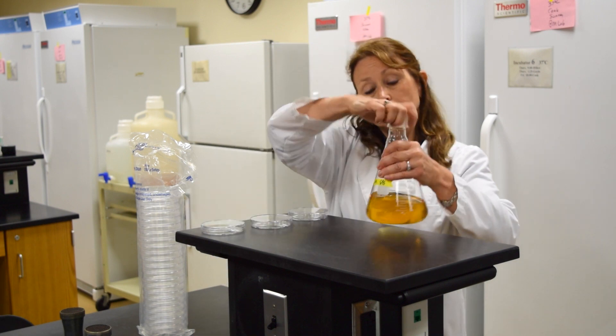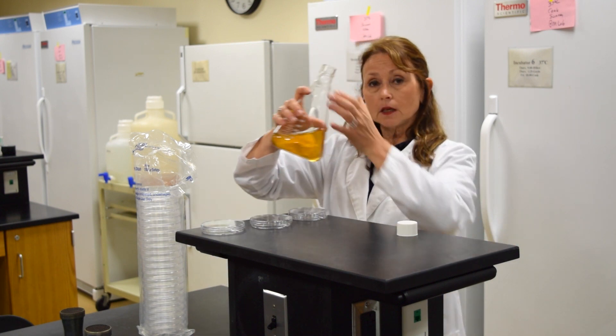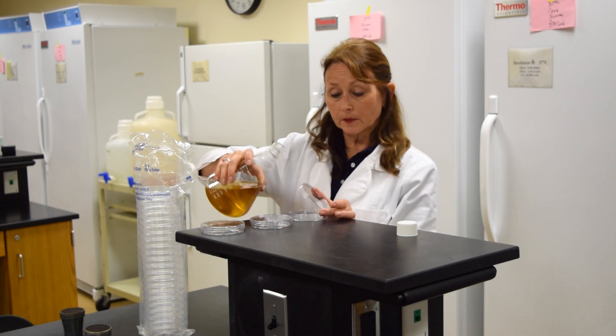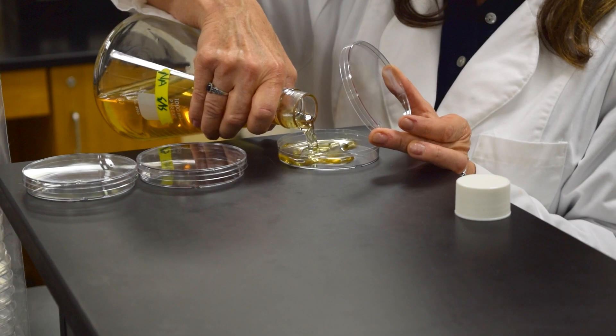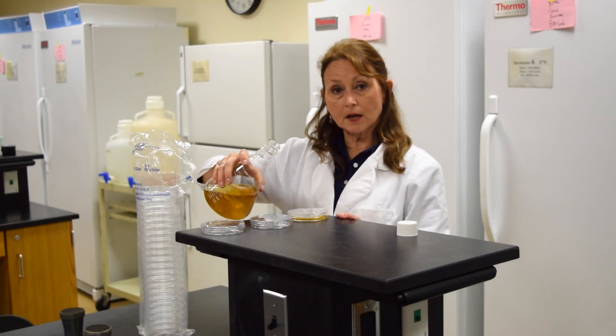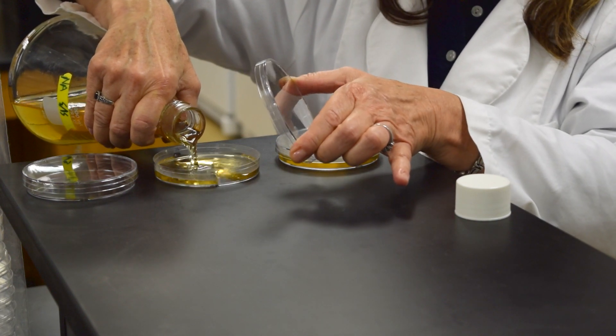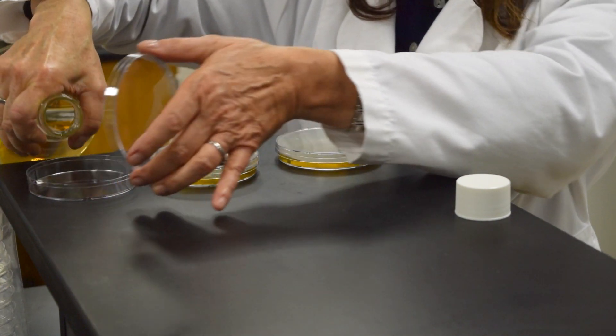You can open up the flask — the lid of the culture media. I'm going to hold the lid, pour the plate, and put the lid right back down. I want to pour the plates half full, making sure that the bottom is completely covered.